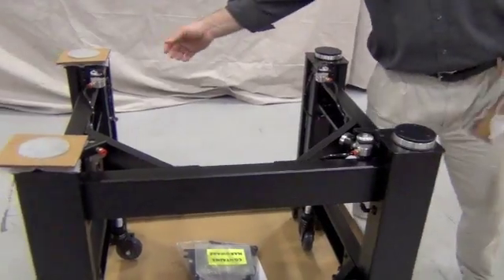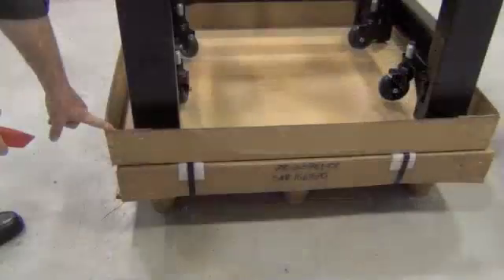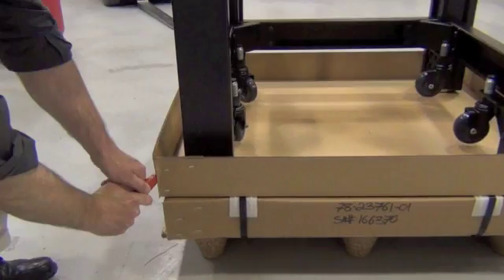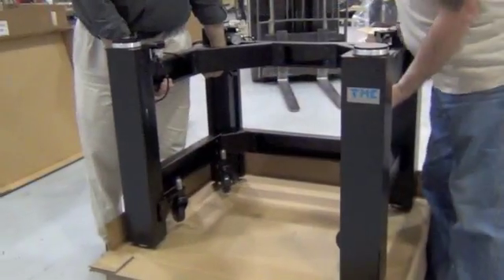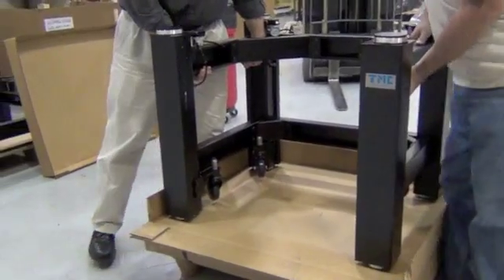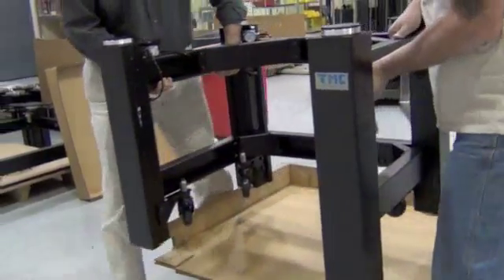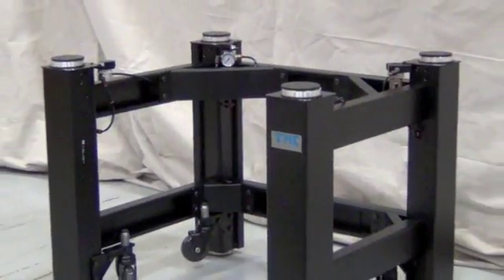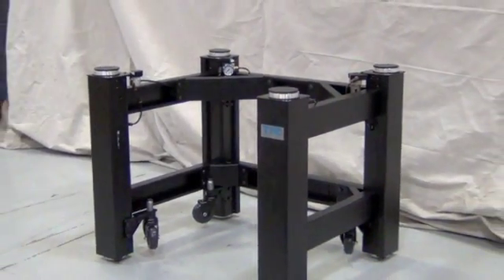For smaller frames, two people can lift it out of the box. To make it easier to lift, we are cutting back the cardboard box. Place the leg frame in the position it's going to sit in the lab. Once the top is in place, it is much more difficult to move.